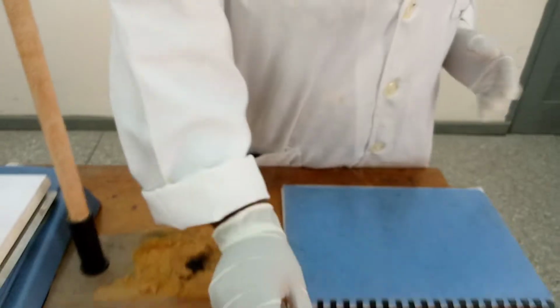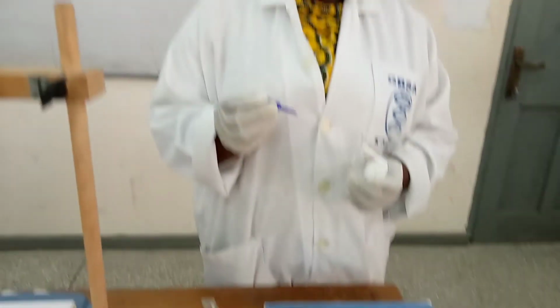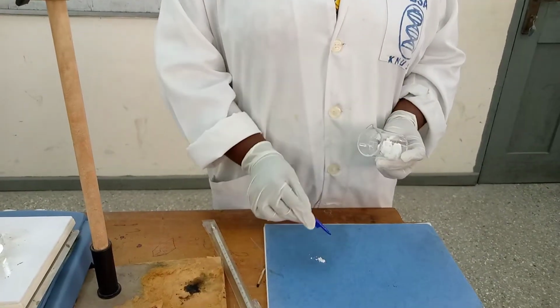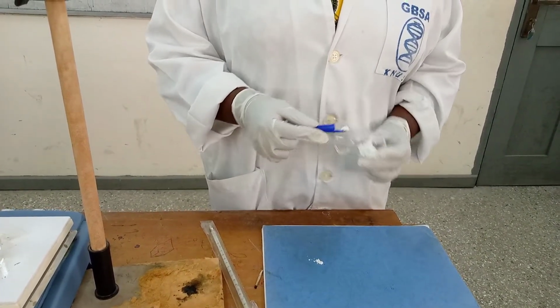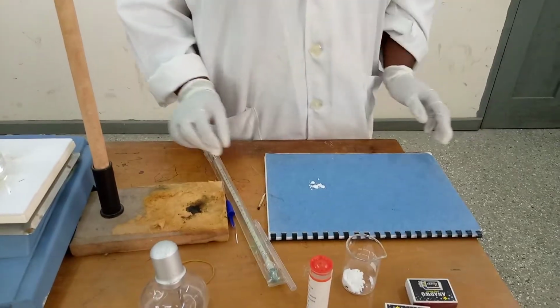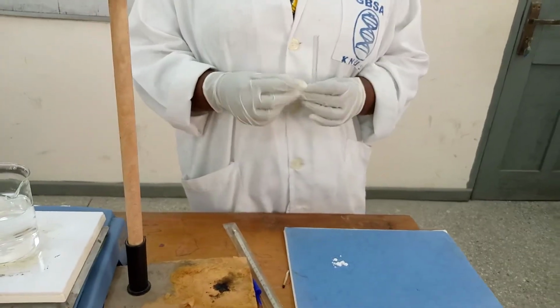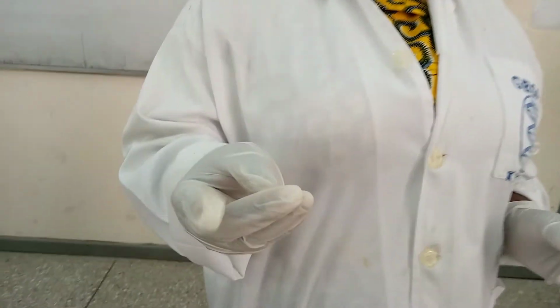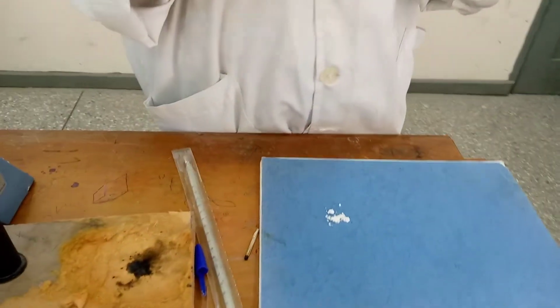Okay, so you fetch some small amount of the sample. You fetch it here. You can use a petri dish if you have it, but I'm using the back of this book. And you need the case of a big pen or any pen at all. So what I'm going to do is that the open part of the capillary tube, remember we have closed one end, so the open part, you dip it in the sample. So let me demonstrate to you how to fill it.